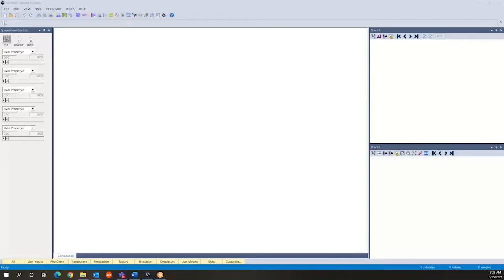Thank you for joining me in this first AdMet Predictor interactive tutorial dedicated to working with files. The topics we are going to cover today include opening and saving files, importing fields from an external file, and exporting work to Excel.